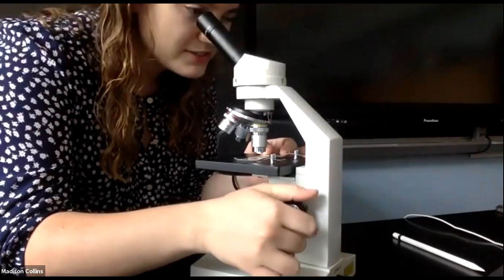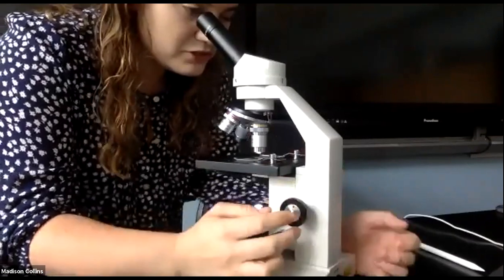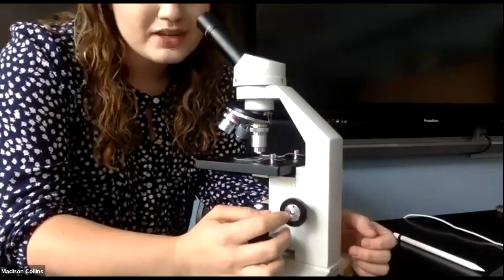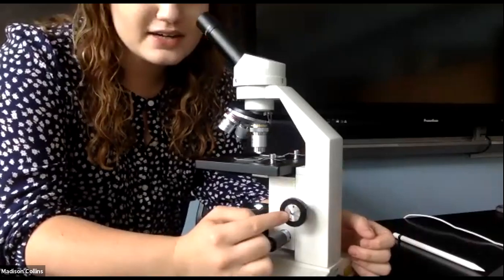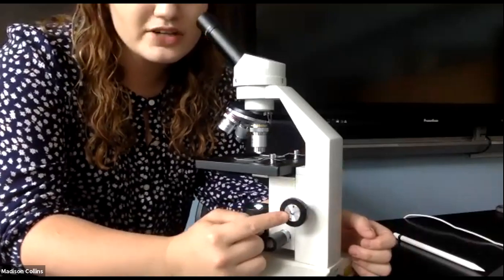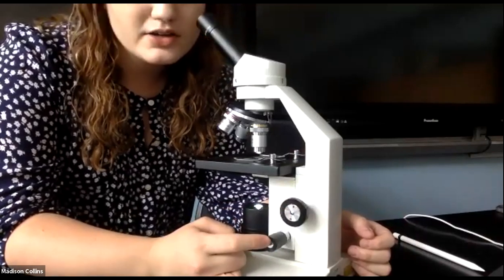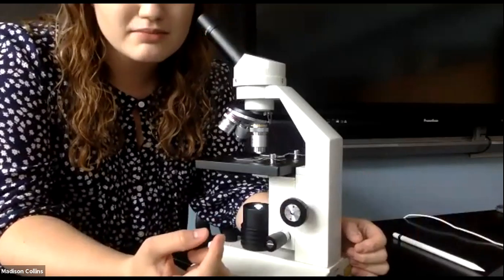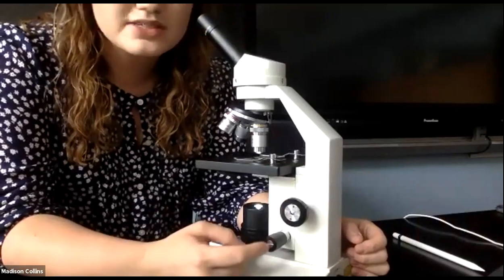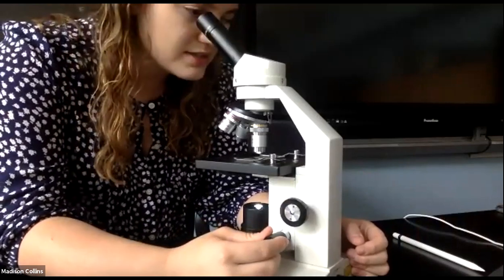There it is, until I see the object come into focus. But you'll notice that when you're using the coarse adjustment, the image isn't as crystal clear as it can be. And because it's not as crystal clear as it can be, we're then going to use what we call our fine adjustment, which is this small knob right here, to round out the edges of that picture and make the details more clear.